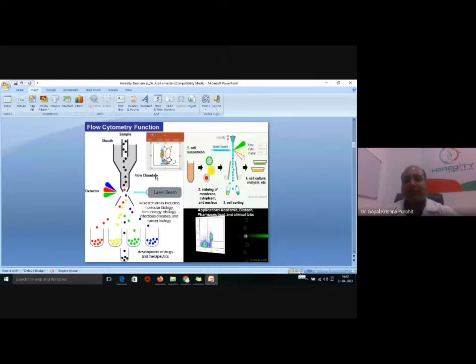Uses of flow cytometry include cell sorting, determination of cell characteristics and functions, determination of microorganisms, biomarker detection, diagnosis of healthcare disorders and blood cancers, and measuring genome sizes also. Flow cytometry has various uses that have greatly impacted scientific research and the development of drug therapeutics. Its many applications have resulted in use at academic, biotech, pharmaceutical and clinical levels also. And it has more advantages also.